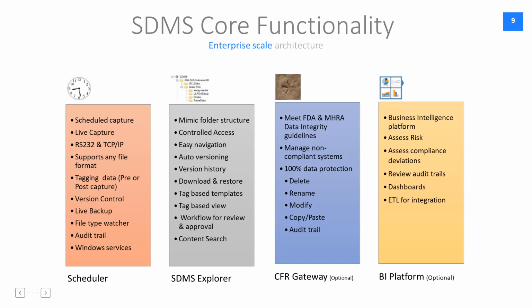Logilab SDMS tag-based templates is also a very unique feature where you will be able to create templates based on your tags. That means you can have a meaningful way of viewing your data. The templates will help you in viewing your data in a more meaningful manner. Let's say for a quality control lab, you would like to view the data based on the product and batch number. You can create a template based on the product and the batch number for viewing your data.